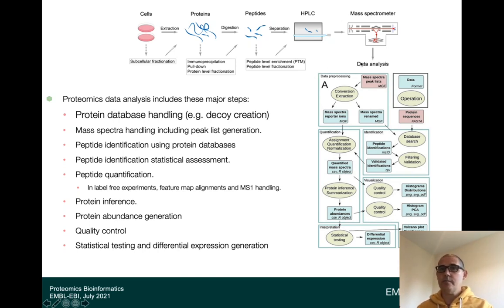And then in the mass spectrometry part, there is also a huge difference between the different methods of how you capture the spectra. It can be DDA, DIA, and so on. But I will not go into details on those things, because I hope somebody else has explained that before. If not, there is plenty of documentation about that on the internet and in the course.